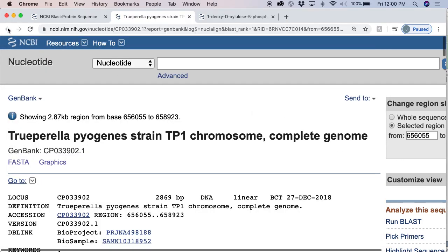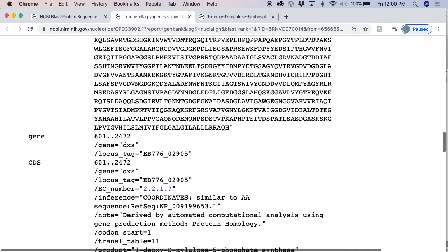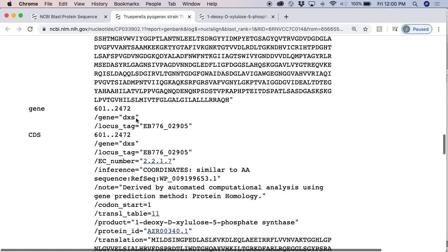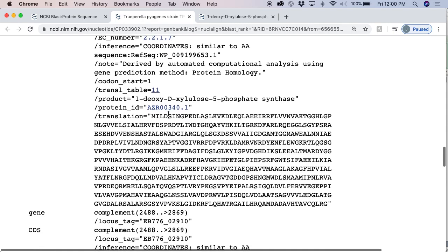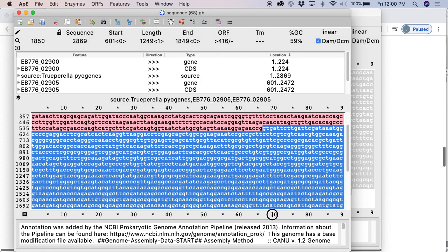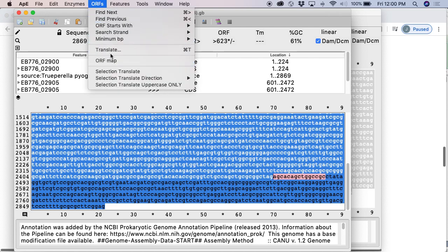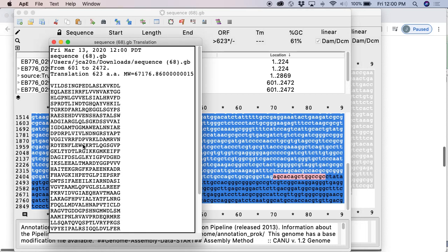Here we have our gene DXS — it starts at 601. You can look at these numbers and know where it is. But the safest way to do it is to note the protein sequence here that starts MILDS. We can grab this sequence that we think it is and then go ORF translate. V-I-L-D-S — because it's a GTG start, that's a V instead of a start methionine. So this looks right — that is our CDS.